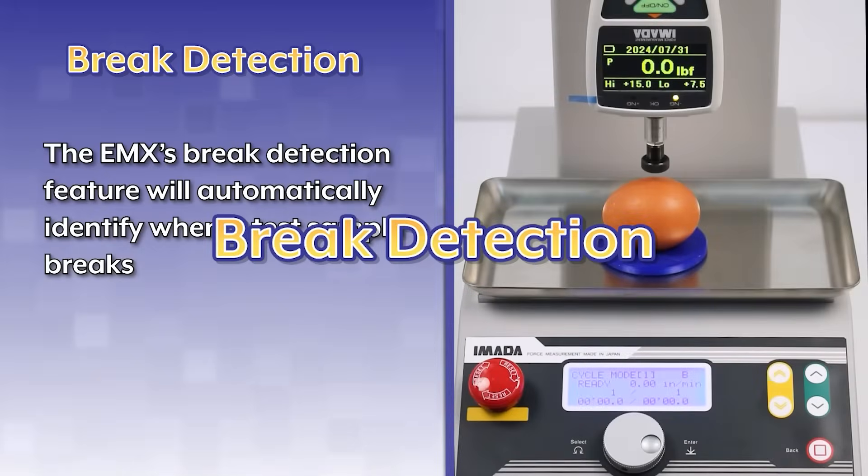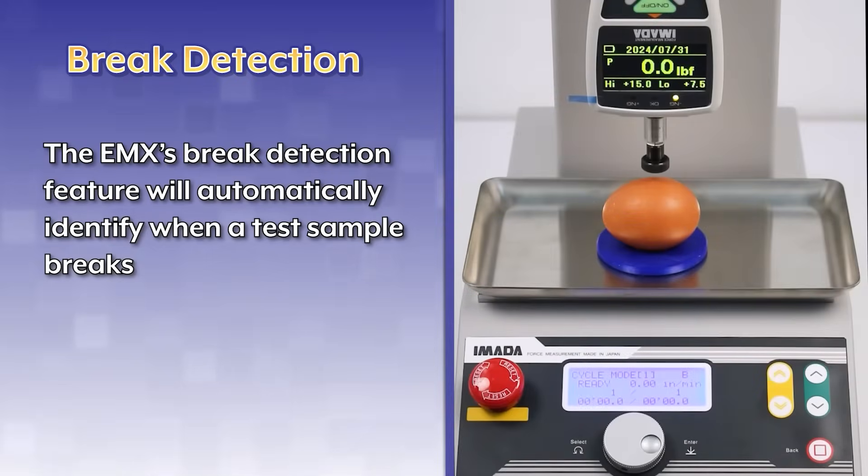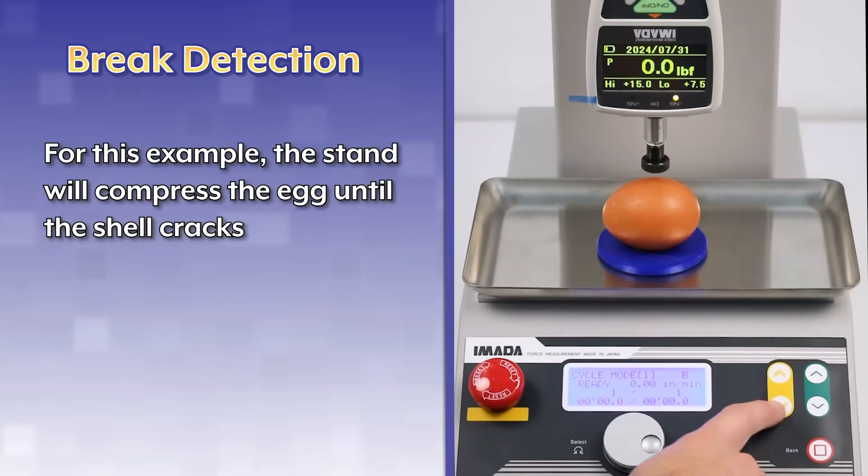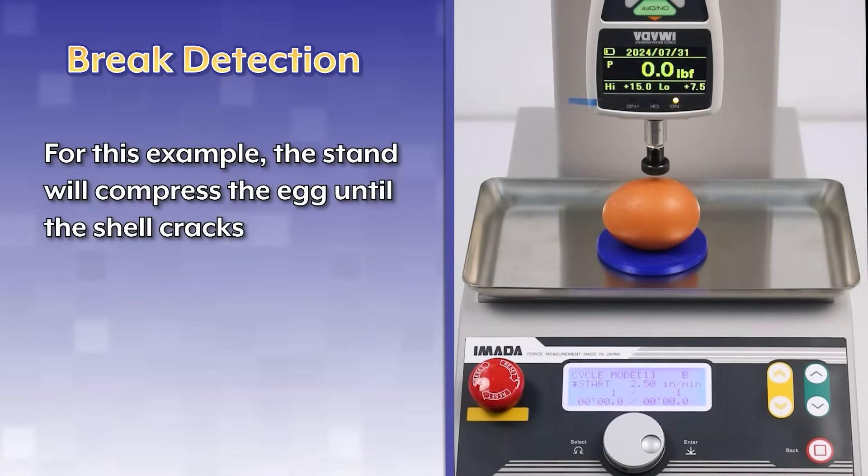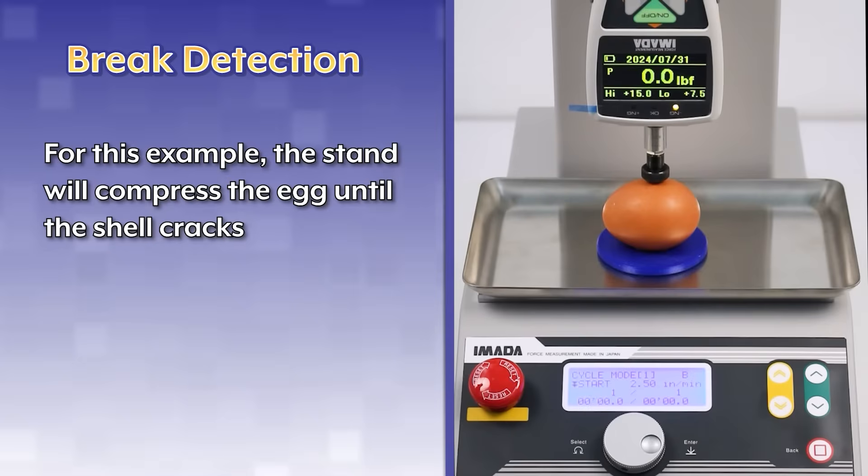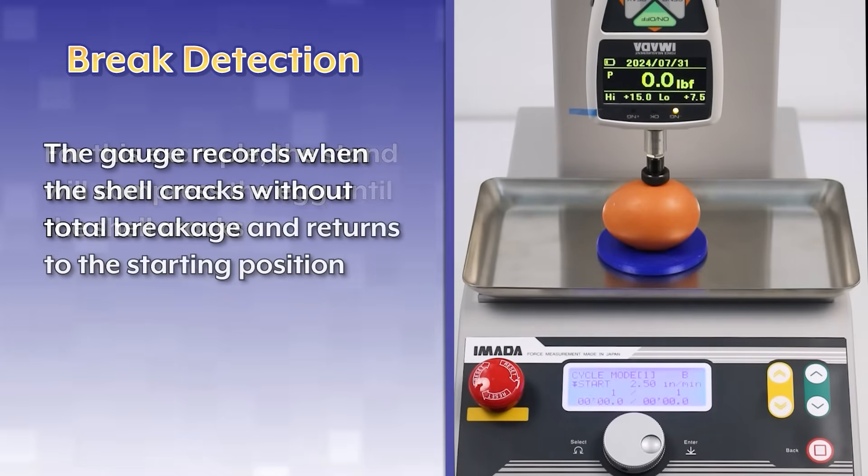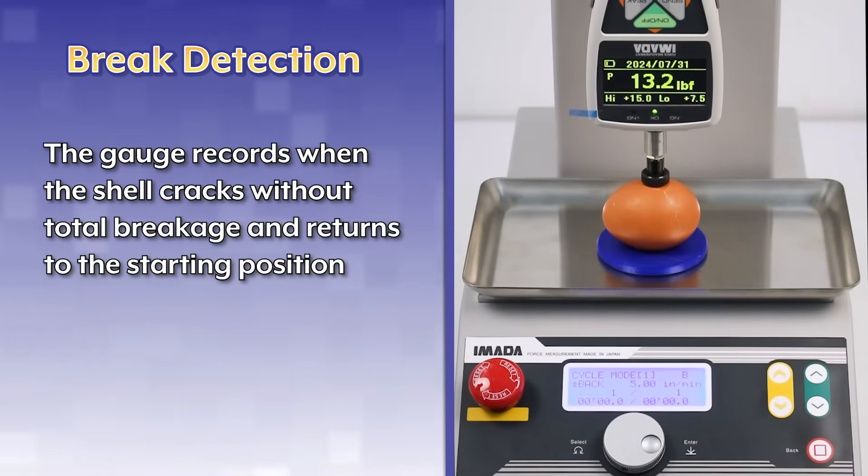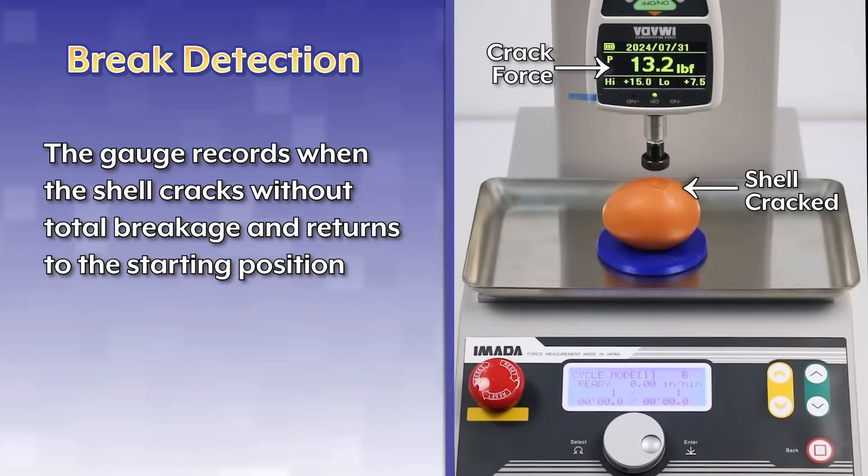The EMX's break detection feature will automatically identify when a test sample breaks. For this example, the stand will compress the egg until the shell cracks. The gauge records when the shell cracks without total breakage and returns to the starting position.